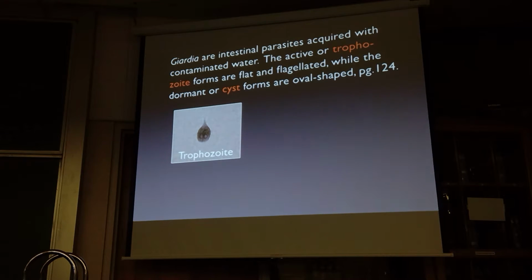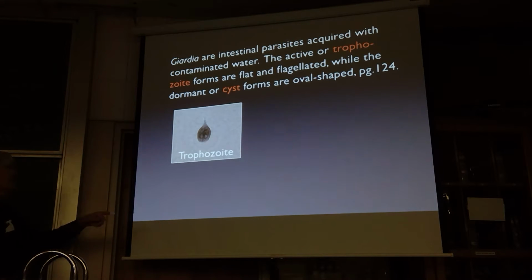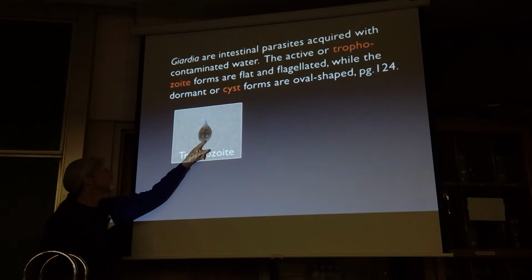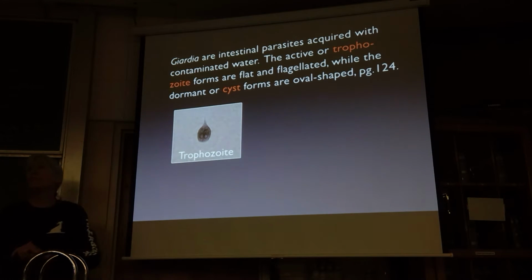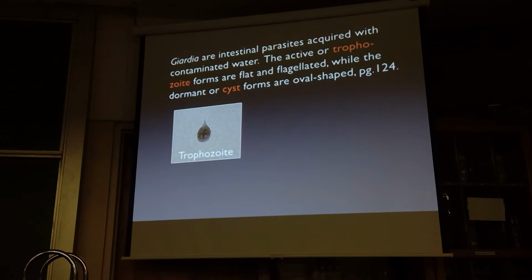The prepared slides of Giardia, you cannot see that unless you have the 45X objective. They're in stool sample material because they live in the gut. So the slide isn't stained a particular color. These things are just kind of gray or tan. But look for the teardrop shape and two nuclei. So that's what the trophozoite looks like. And again, they have flagella, but we don't have flagellar stains, so you can't see them.